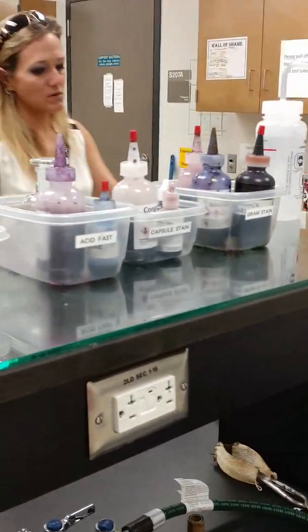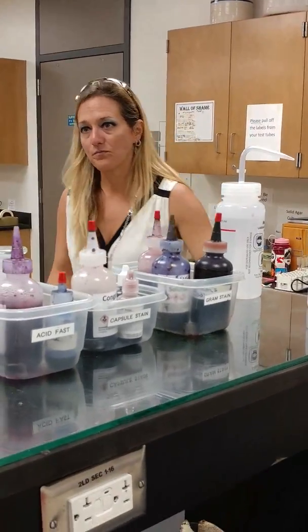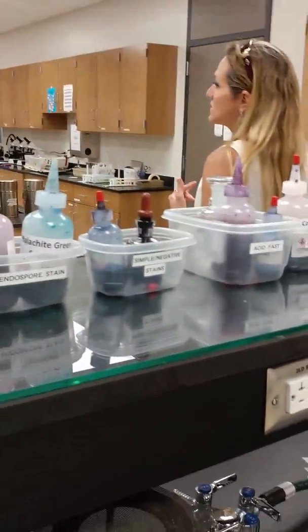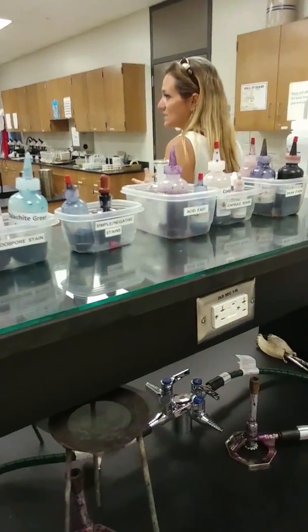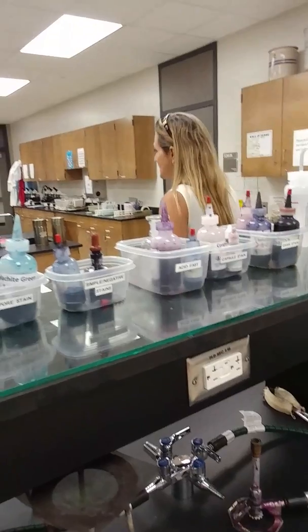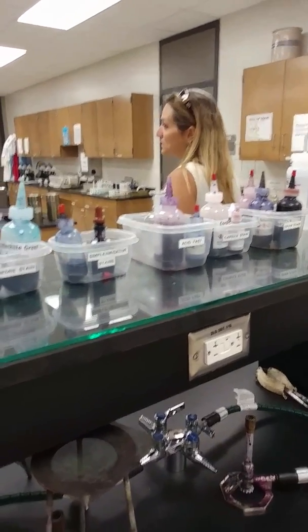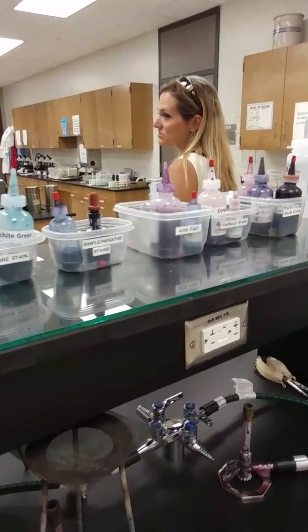For this one, everything's in the media — you just look at the tubes. Any questions on that one? Today, what you're going to do is go ahead and get started on your BP test and your inoculation. I'll give you a few minutes to do that, and then I'll start coming around asking you the questions.